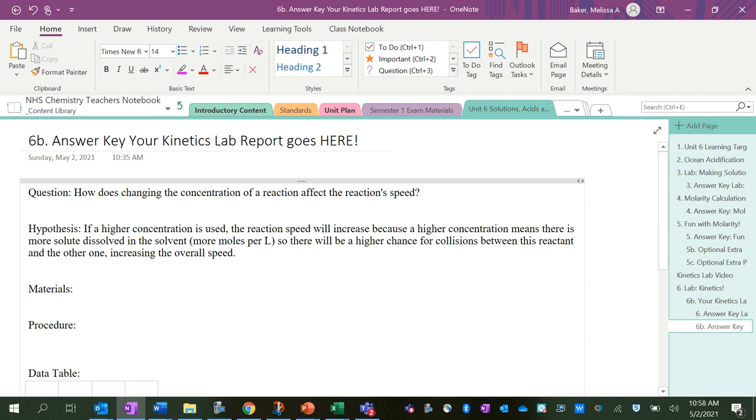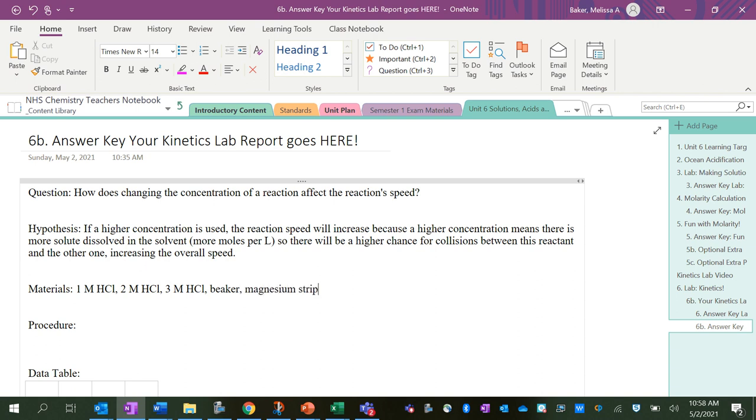Materials we already looked at: 1 molar HCl, 2 molar HCl, 3 molar HCl, beaker to do the reactions in, magnesium strips, graduated cylinder to measure it out in, and we're going to need a stopwatch on your phone or something similar.